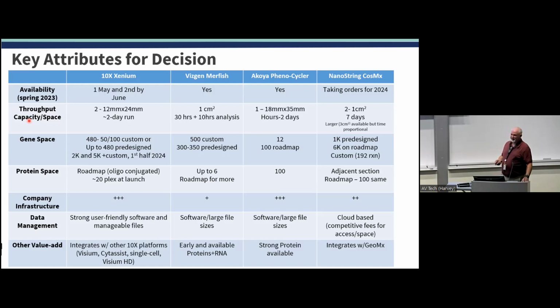So I am not a bioinformatician by any way, shape, or form. And the data management for the Xenium in particular, I downloaded the Explorer software, and I'll show you some images that I generated in about 10 minutes. So that's pretty remarkable from my perspective.